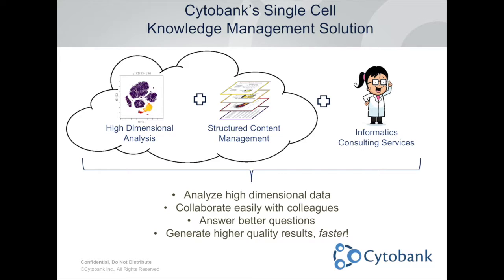However, we also have an informatics consulting service. So if you have questions about analysis, if you have a need to develop some SOPs, or to analyze a large cohort of data that you've already collected, we'd love to help you out with that.